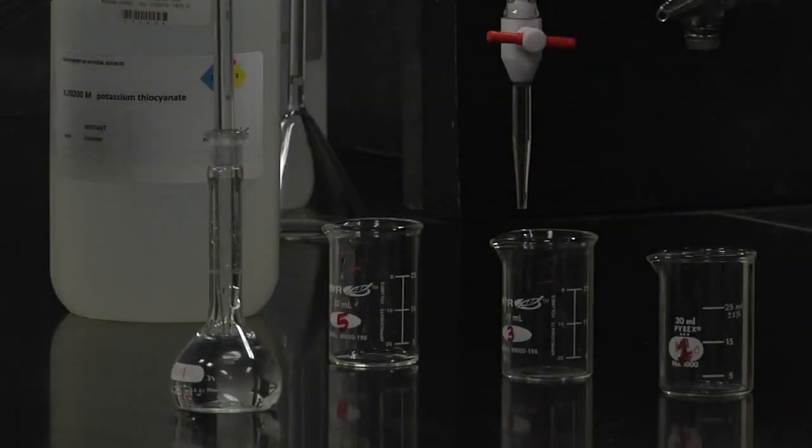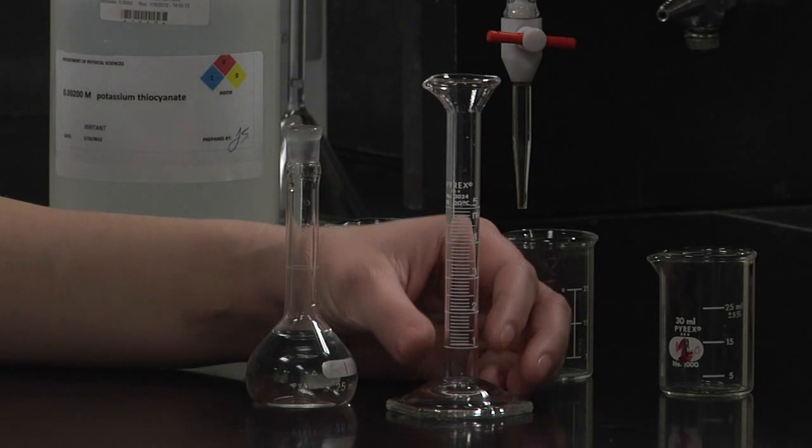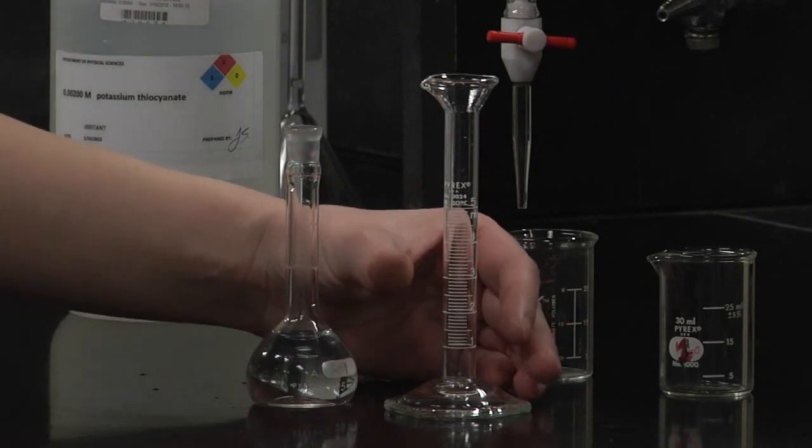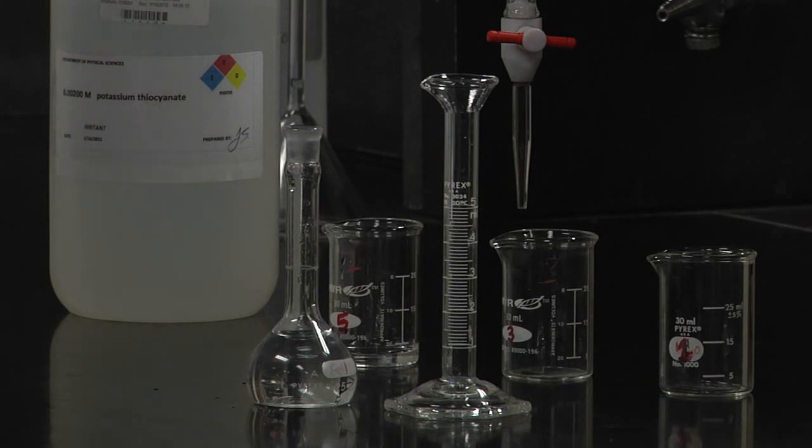Now we're going to take our 5 milliliter volumetric pipette and fill it to the calibration mark. For beaker number three, we're going to add 3 milliliters of this. If you don't have a 3 milliliter volumetric pipette, what I like to use is just a Pasteur pipette and a graduated cylinder.